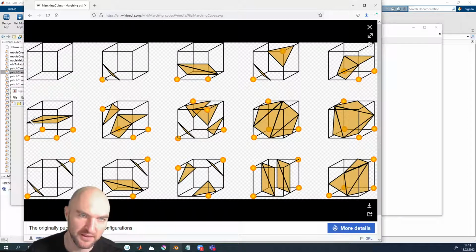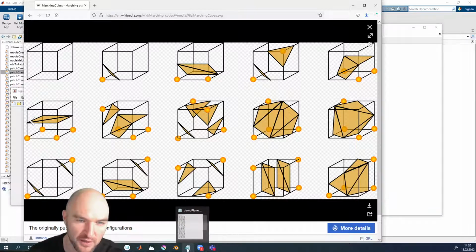But of course, if you have, for example, this situation here, and the threshold value is very close to this vertex value, then this triangle is going to be very close to this vertex, so it's going to be a very, very small triangle. So if I then base my analysis on the location of the individual atoms relative to those vertices, and I just do the analysis on a per vertex basis, then each one of those vertices is not going to have a lot of atoms associated with it. And this means we're going to get a counting noise essentially.